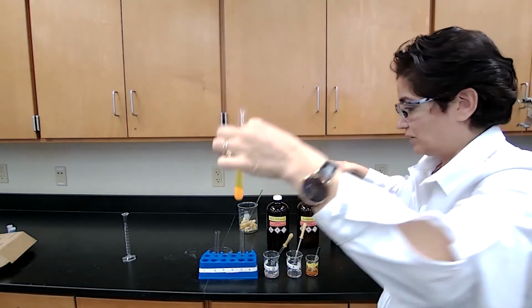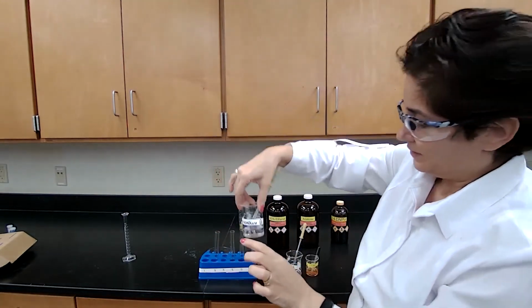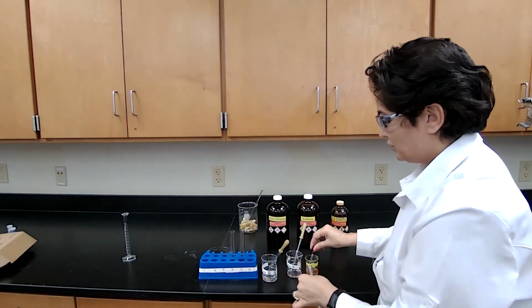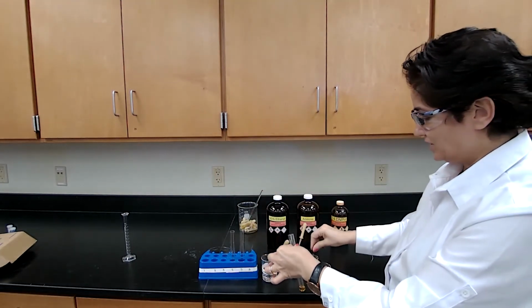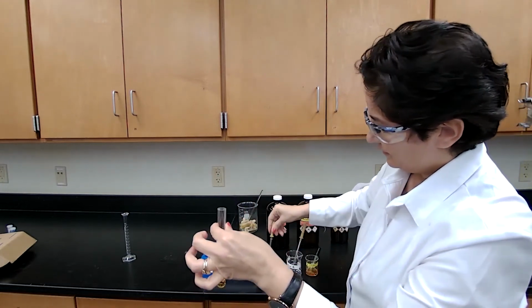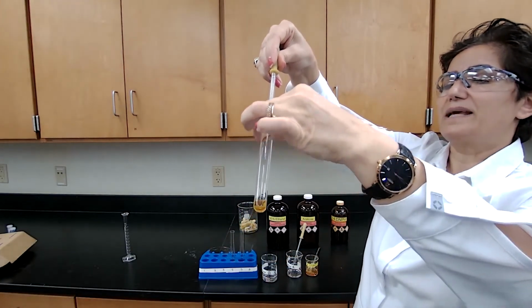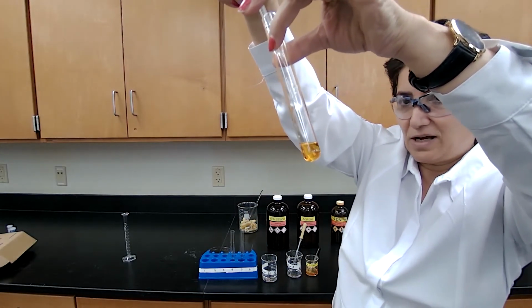Okay, good. For unknown B, I would add the reagent, the 2,4-DNPH again, plus drops of unknown B. When I add the unknown B, see the consistency is not changing.